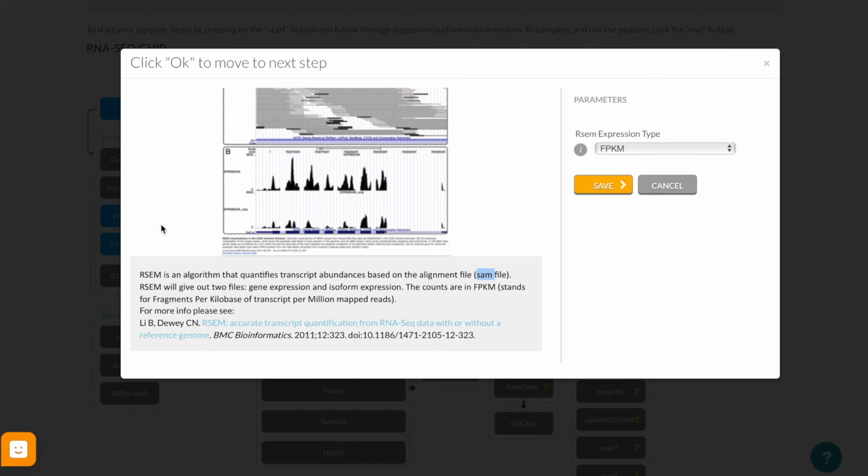Now, quantification is not as straightforward as you think. Quantification of reads requires us to have some expectation of general noise. So we expect the reads to be placed in many different locations at approximately the same rate. But if there's some kind of natural variation that is actually in the data, we would expect that to have some abundance above that level of noise, and that is what's called expectation maximization.